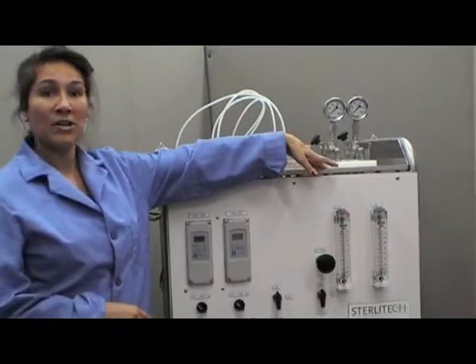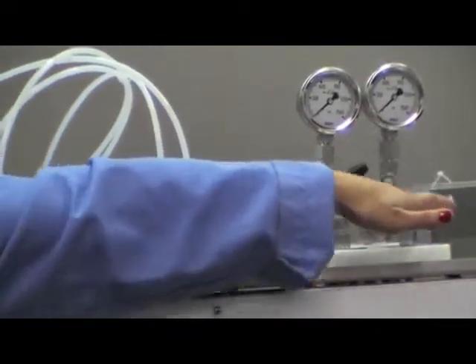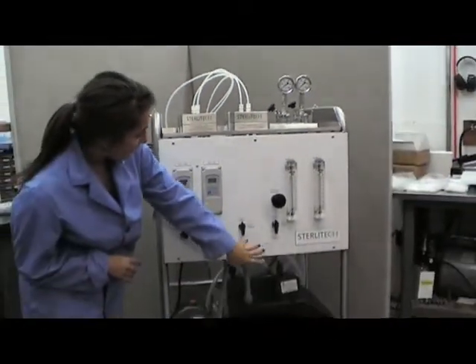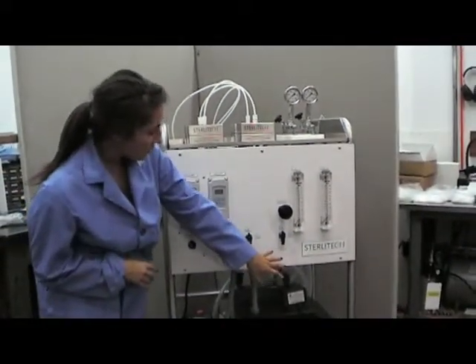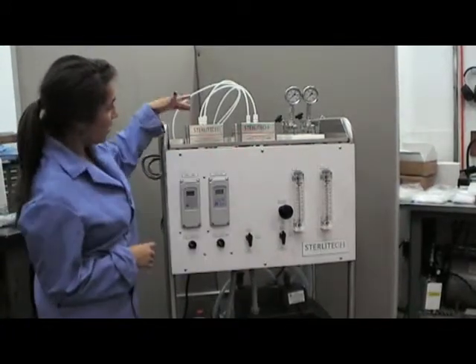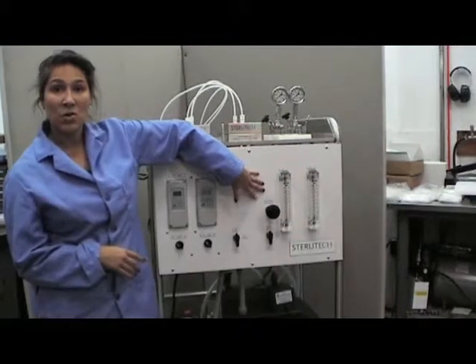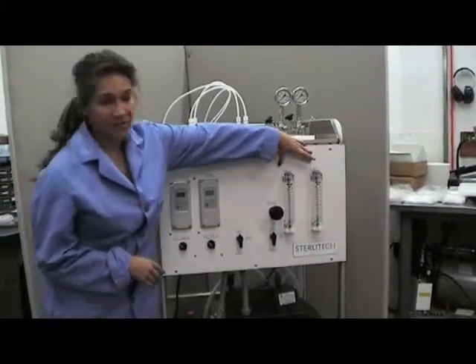Over here we have your back pressure control valves and they're also marked for line one and line two. Over here you'll see the two line switches for line one and line two. Your bypass or brine valve as well as the flow meters.